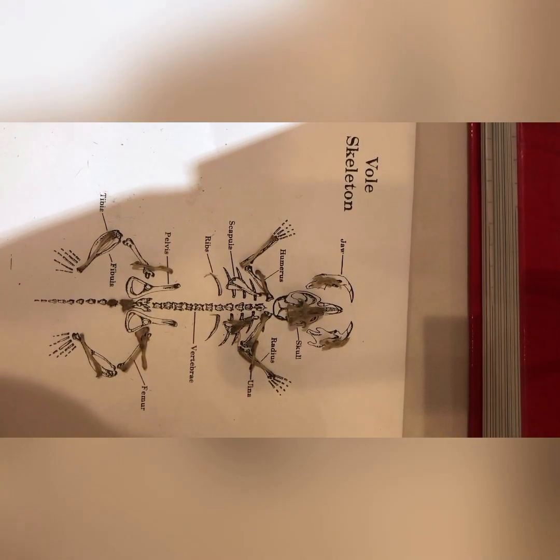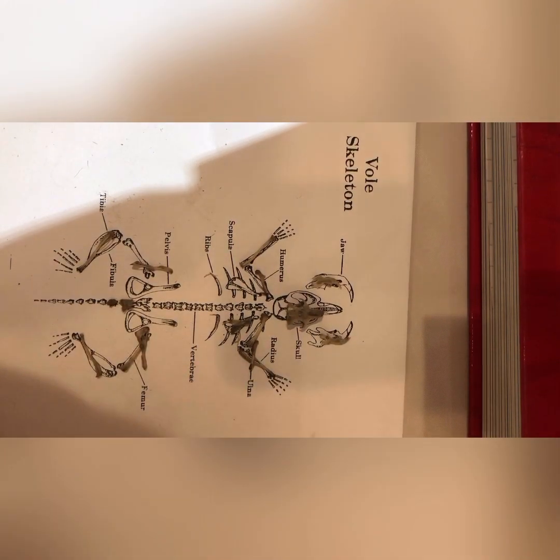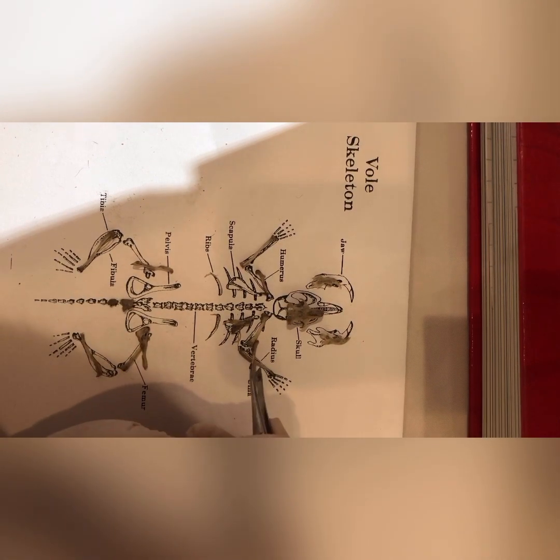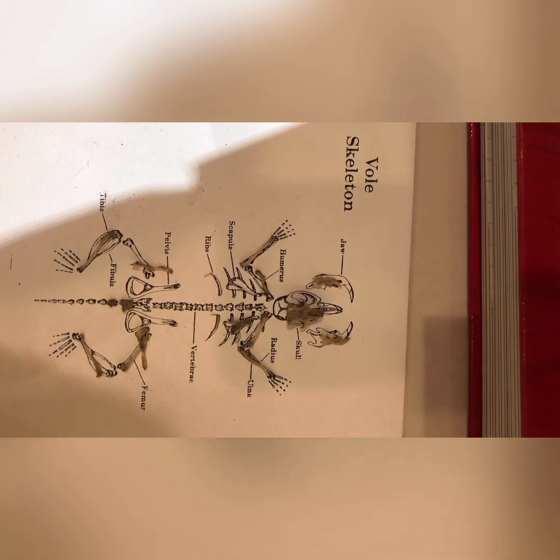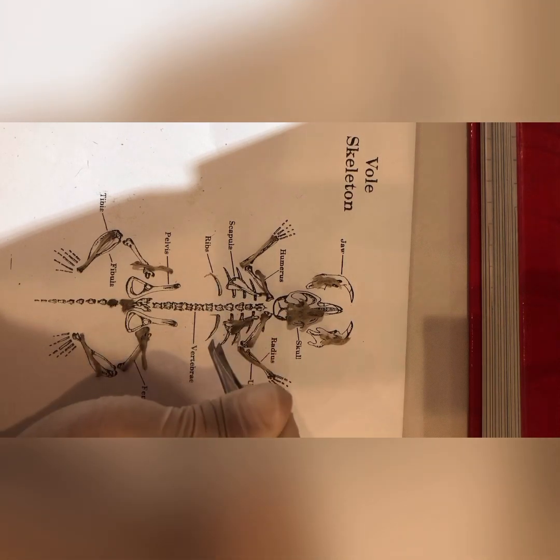So what we see here is an almost reconstructed vole skeleton from our owl pellet. We have the two jaws, we have the skull, I have the radius and the ulna, I have the scapula, which is right here. We have some of the ribs.